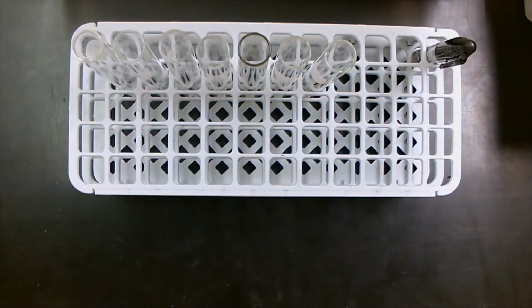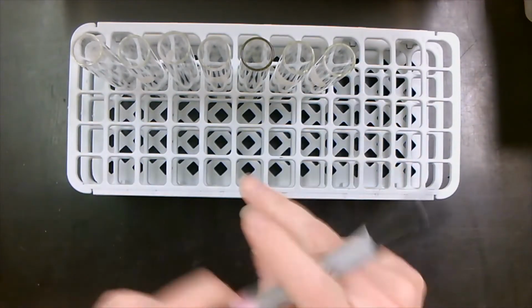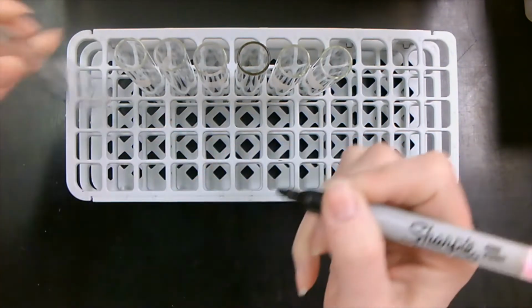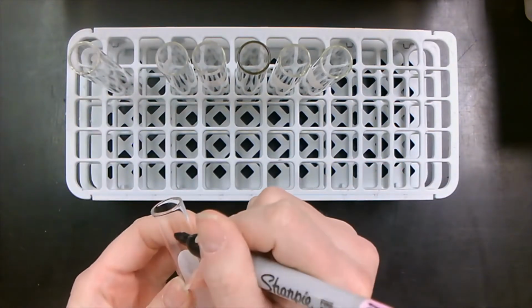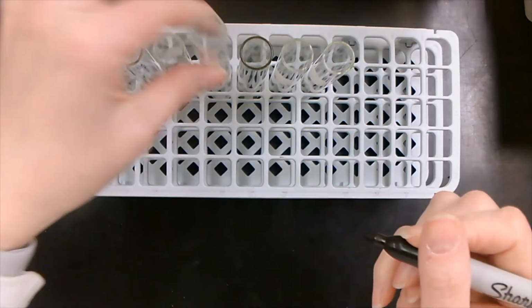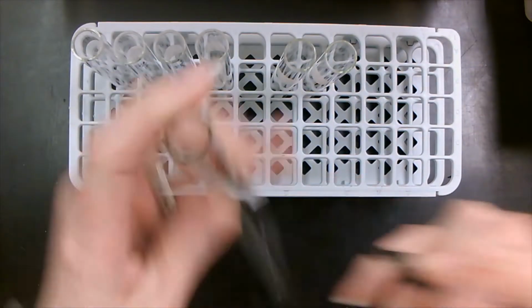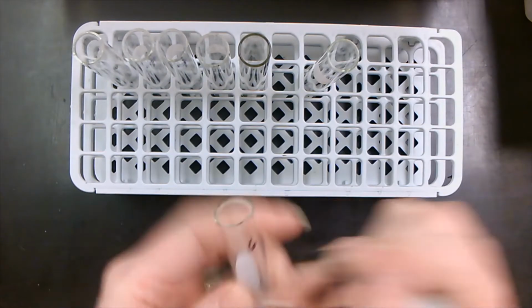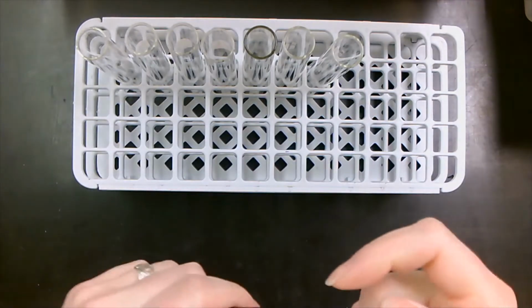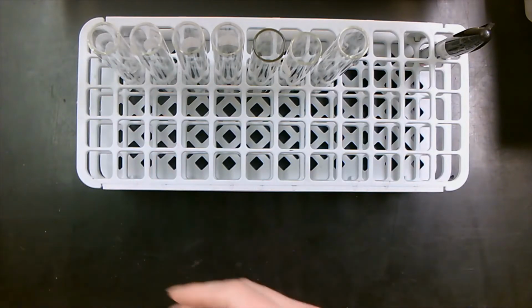So we're going to start off with having our test tubes. Since we're putting these in a water bath, we need to be able to label our test tubes. So we're going to be writing on our test tubes, writing down numbers which correspond to the solution we're going to be adding. Okay, now that our test tubes are labeled, let's start adding to them.